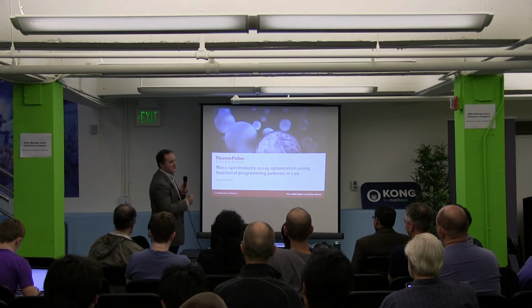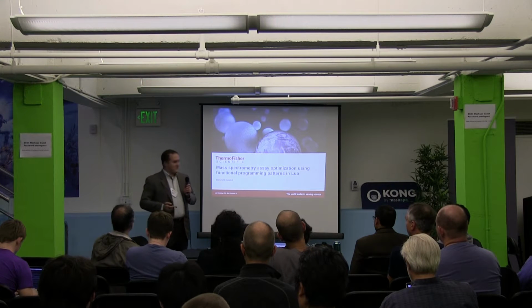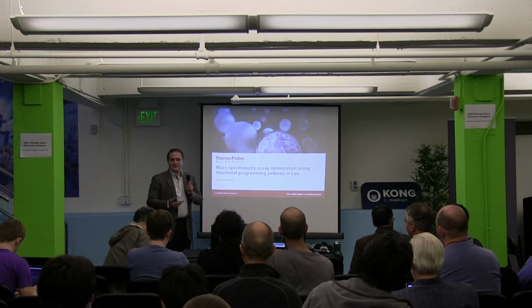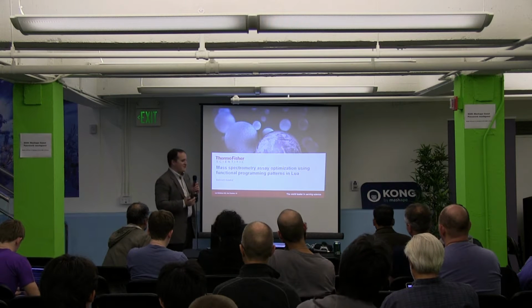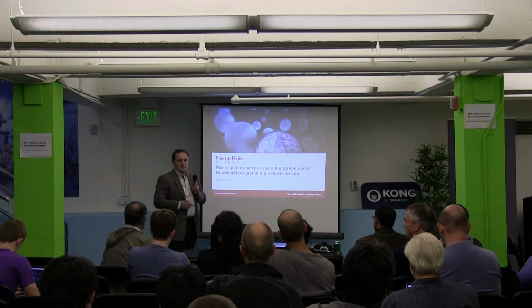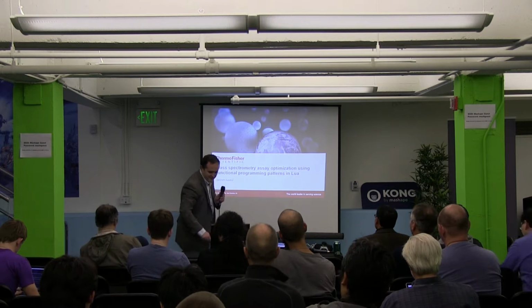I'd like to, maybe this is a shift of gears, and talk about using Lua for control of instruments, namely mass spectrometers. And I'm going to focus on the last third of the talk, and by third I don't mean the time, but the last organizational third of the talk, on use of some concepts from more functional languages to automate assays and compose automations.